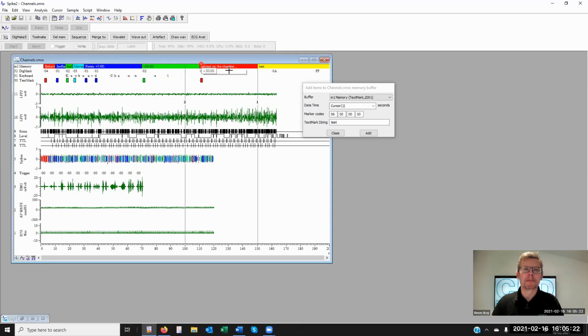Okay, so memory buffer. In this simple case, we're using it as a form of clipboard. It's very fast to access compared to something that's stored on disk. If we had to access data on disk, modify it, replace, change the data, we would constantly be rewriting the data, and that takes time. So using memory alone makes this very, very quick.